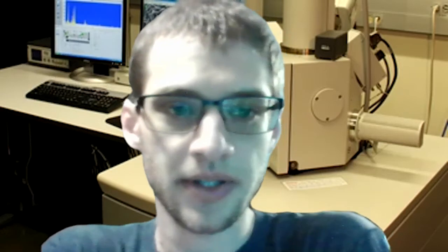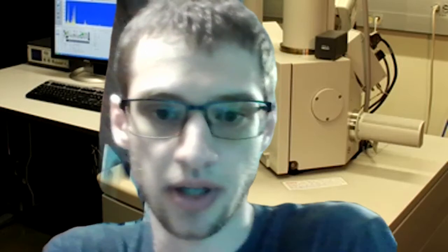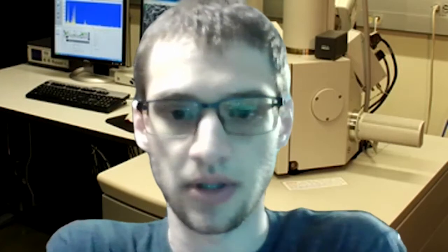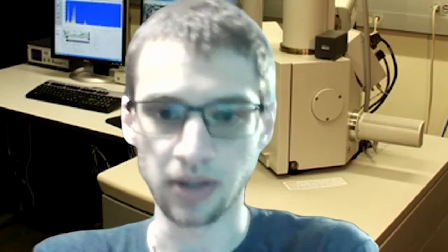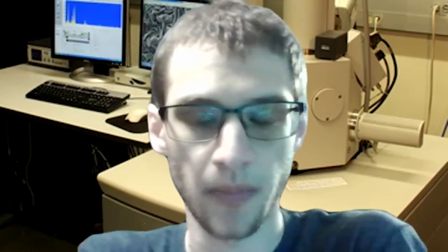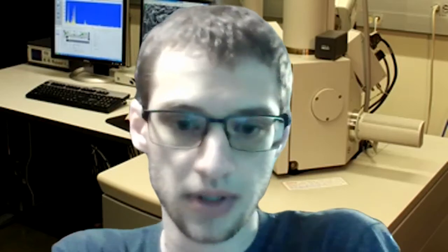So the primary instruments we have in Keck that I help to run are, we have a scanning electron microscope, which you can see behind me in this fake Zoom background. This uses a beam of electrons instead of a beam of photons to take images of samples like a light microscope would. And the electrons allow us to take images down to a resolution of about 100 nanometers, which is much smaller than you'd be able to get with a regular light microscope. So that's pretty cool. We also have two atomic force microscopes, or AFMs.